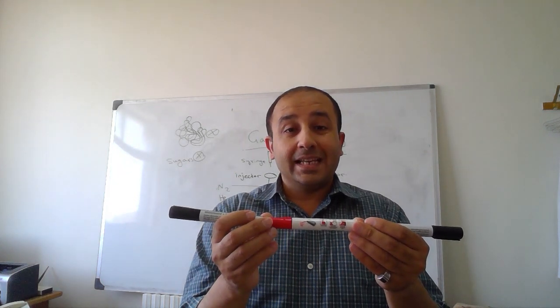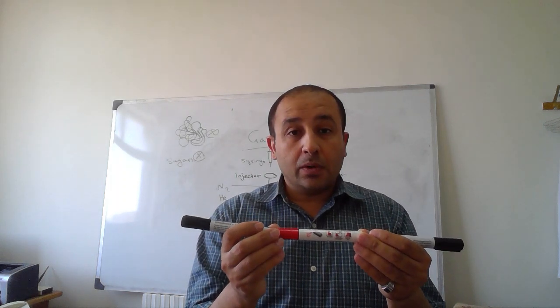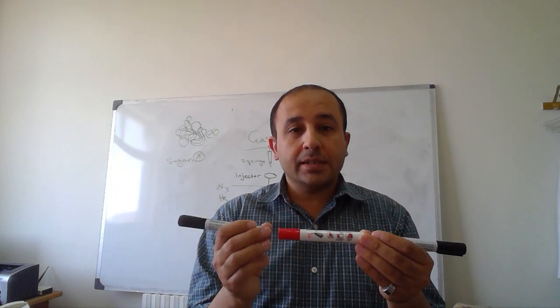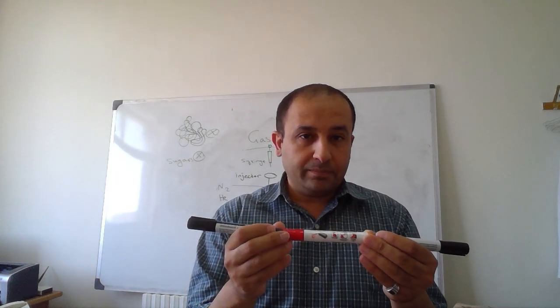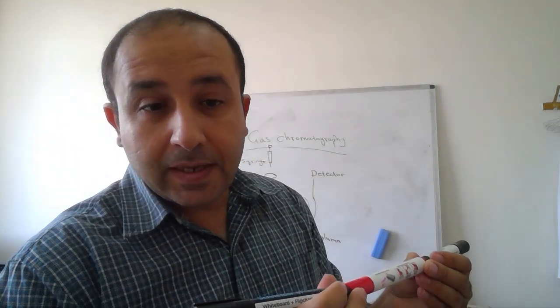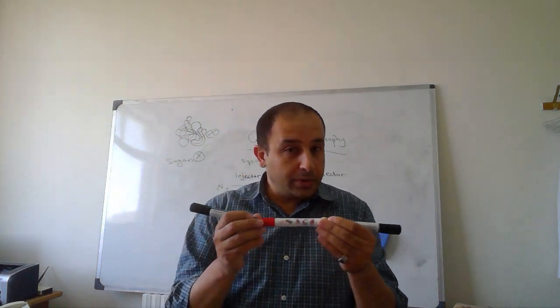This will adhere the compound among its colleagues, and in this case, the volatility of the compound will be negligible. And one of the good examples of such compounds is water or sugars.